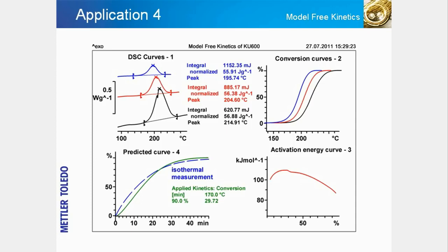This prediction was checked by performing an isothermal measurement at 170 degrees and overlaying the measured and predicted curves. Clearly, the two curves match very closely.